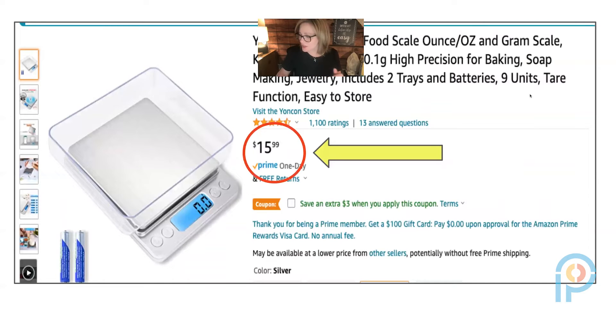Next, I purchased this digital scale and I absolutely love it. It does come with batteries, it lights up blue, and it comes with a little tray for placing items to measure. If you're doing anything with density, measuring mass, or blowing up a balloon to show kids that air has mass, this is a great tool. It measures in ounces and grams and uses the tare method — and it was only $16.